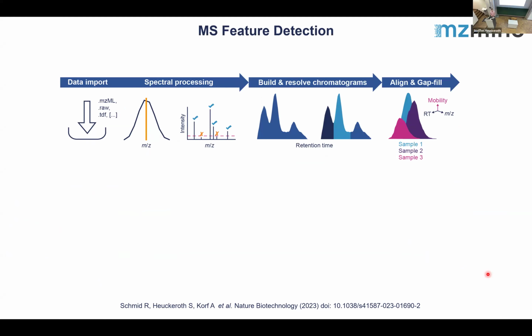And how it works in MZmine, this is a really broken down workflow. You first import your data, if the data is profile.